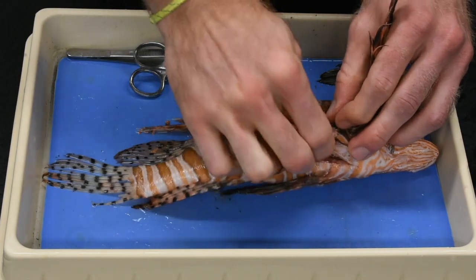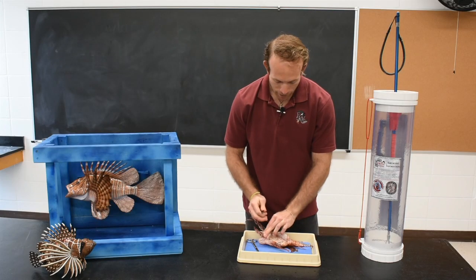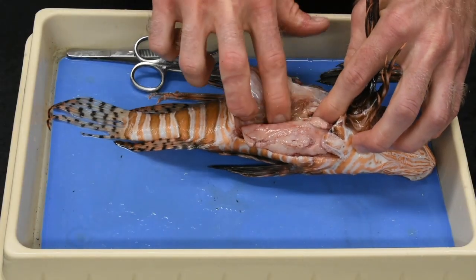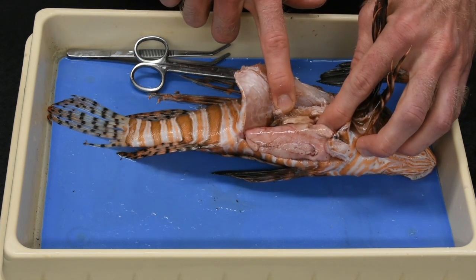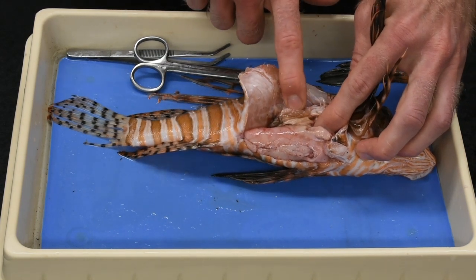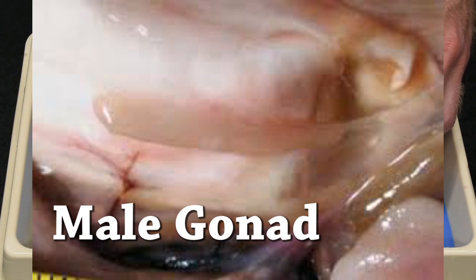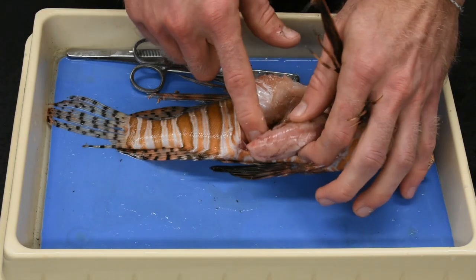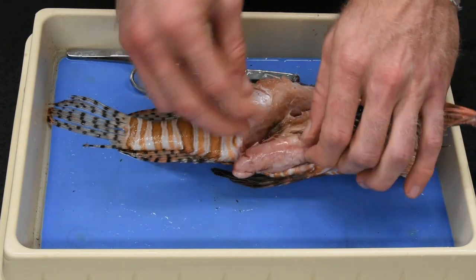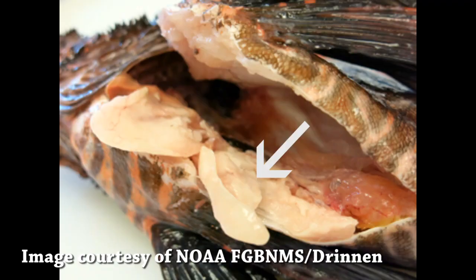Now I can peel back the skin to observe the internal organs. Towards the top of the cavity you'll see a white structure — this is the swim bladder, which is important for regulating buoyancy and helps the fish float or sink more efficiently. Just above that is a pair of structures that are either flat and white if this is a male, or pinkish and potentially filled with eggs if it's a female. Below that we have interstitial fat deposits within the gut cavity, which is abnormal — lionfish eat more prey items than they need to survive, generating excess fat that the liver deposits in the cavity.